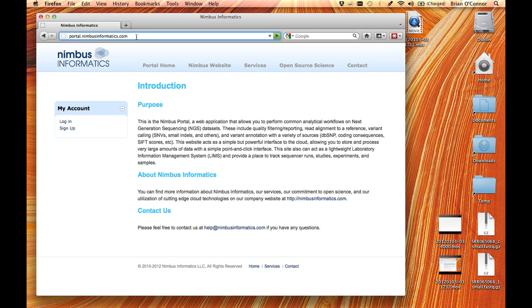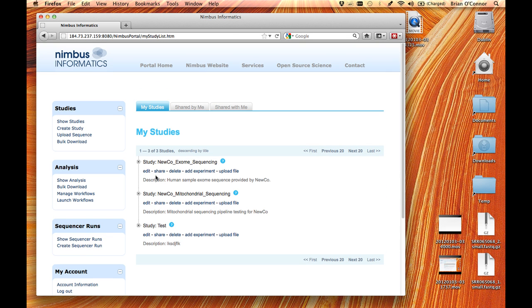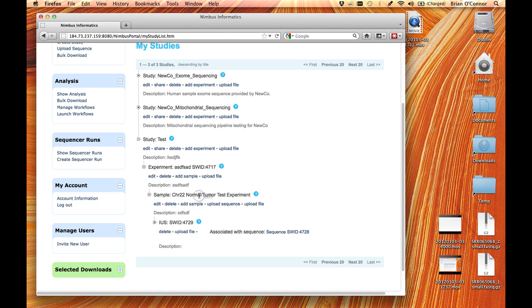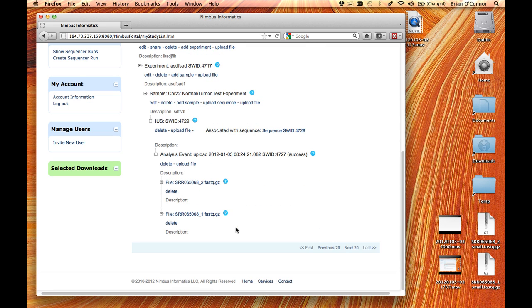Okay, so I'm going to go ahead and just log on here and click Login. I'm logging in as an admin user, but you can log in as your own user. It's virtually the same. Now, the last time we set up this test study, and I associated an example experiment and a series of files with this sample.